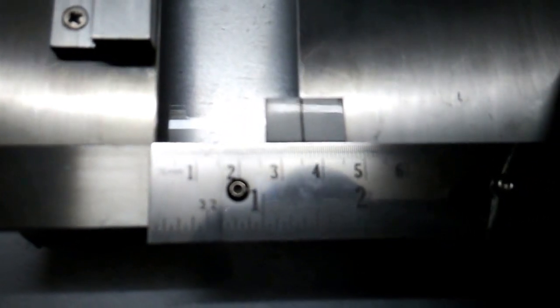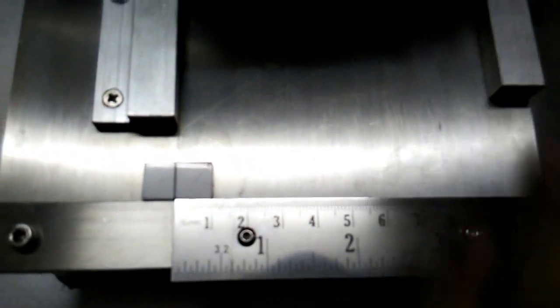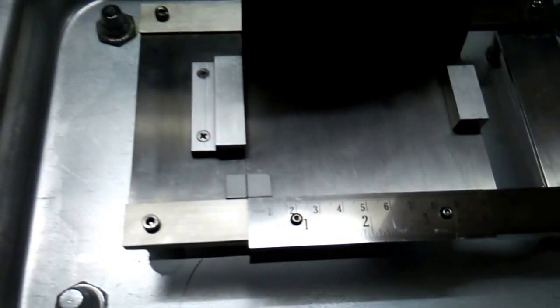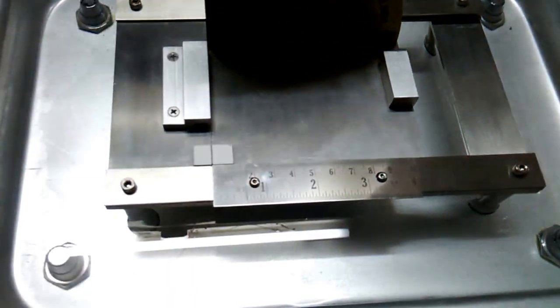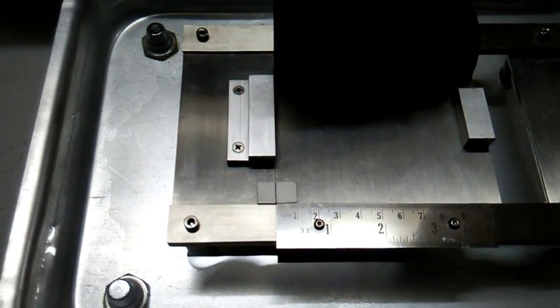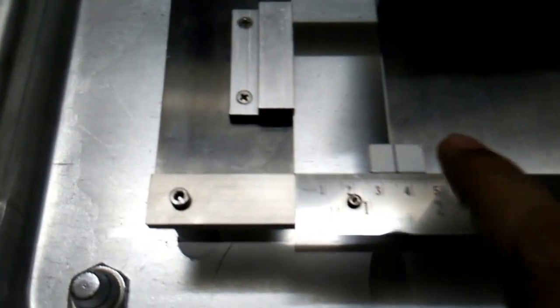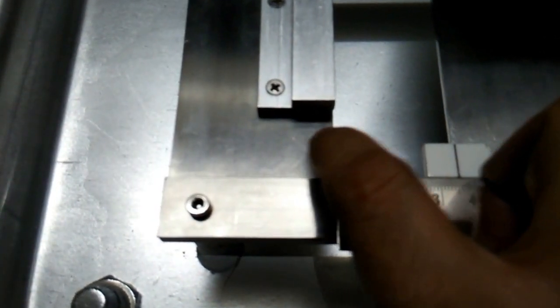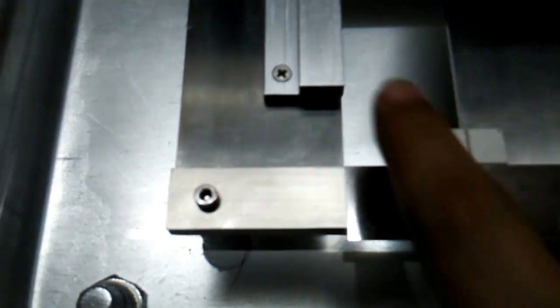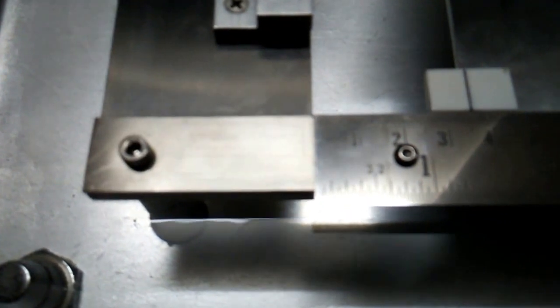You have to fill water into this tank — this container — so that the water level attains this portion. Until this level is attained, you have to just stop pouring water inside.